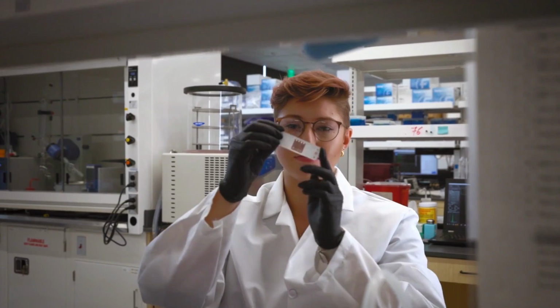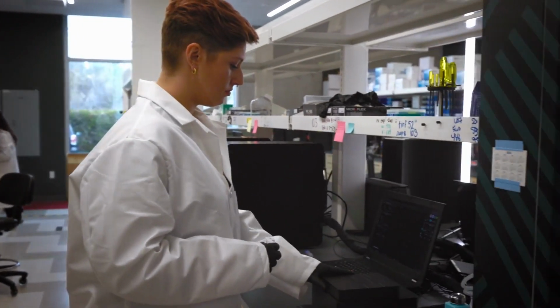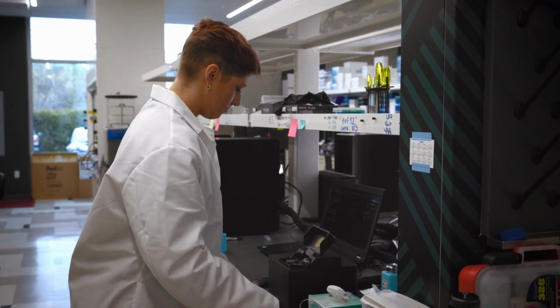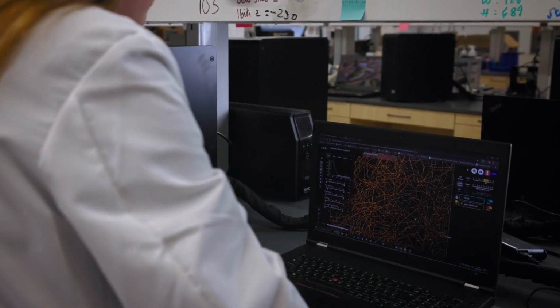Super resolution microscopy is a way for us to see things that are much smaller than we'd typically be able to see with a light microscope. Light microscopes are typically limited to about 200 nanometers of resolution. And what that means is if objects are closer than 200 nanometers apart, we can't actually distinguish them. But what super resolution microscopy allows us to do is we can use some computational tricks, some chemical tricks, and then some computational power to bypass that 200 nanometer diffraction limit, and then we can actually see things that are up to 20 nanometers apart. So really, really small details inside of things like cells, tissues, or we can look at things like nanoparticles, which are typically under 200 nanometers to begin with.